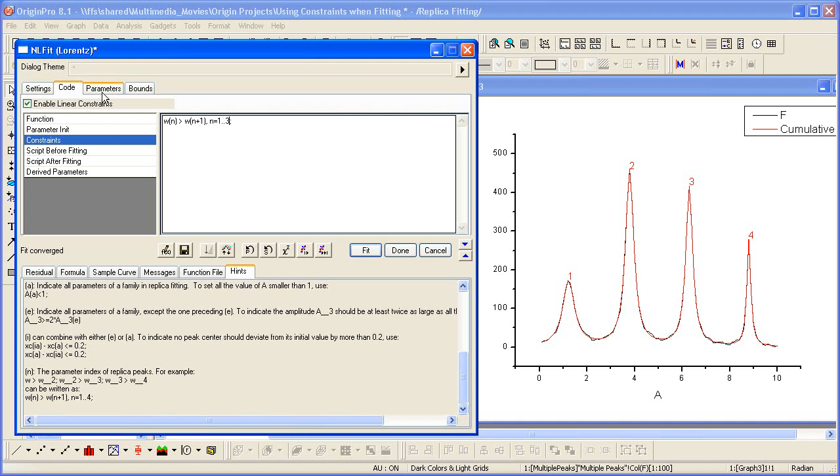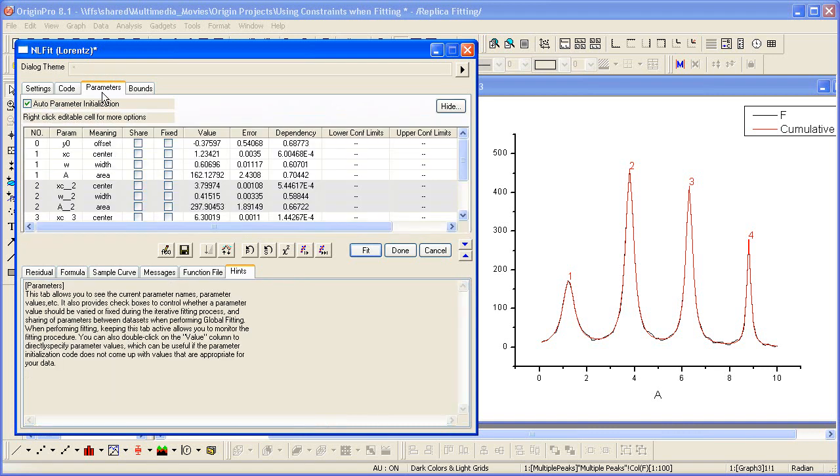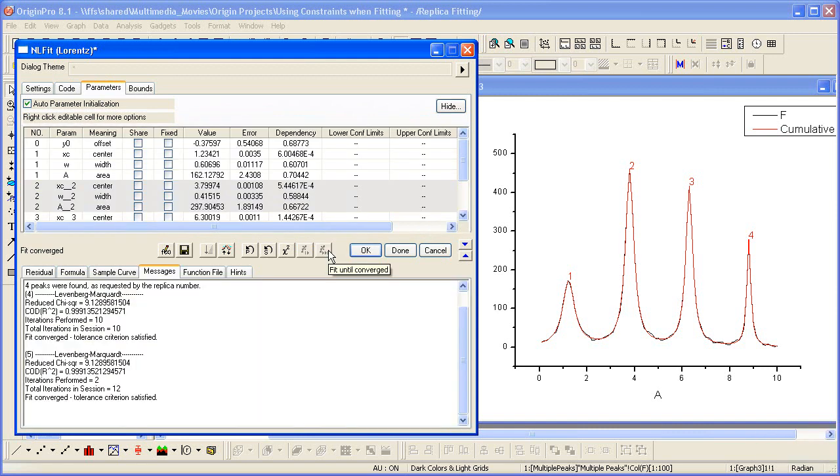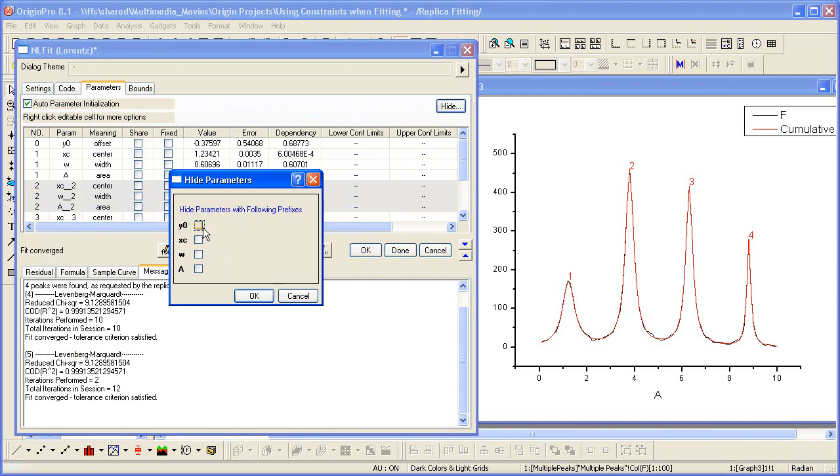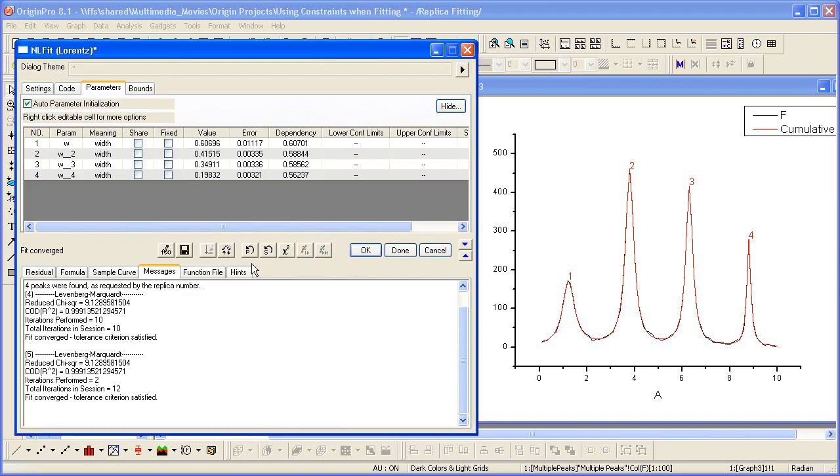Now let's go back to parameters so we can watch them update when I do the fit. Again, it would make it easier here if we click hide, and let's hide all but the width parameter. Now we can see here that each one here is less, so it starts off here, and each successive peak width is smaller.